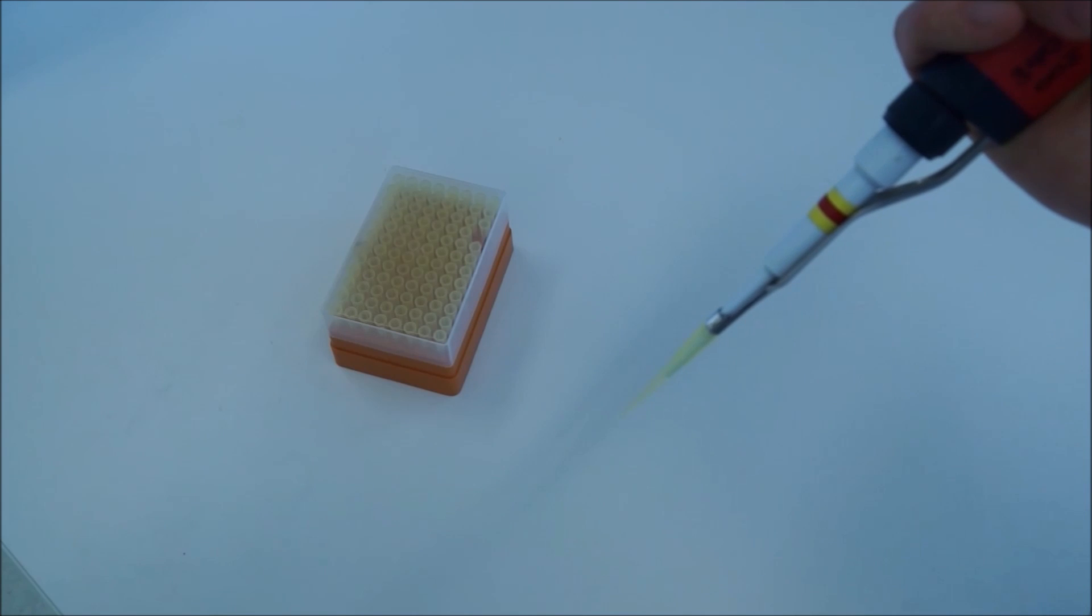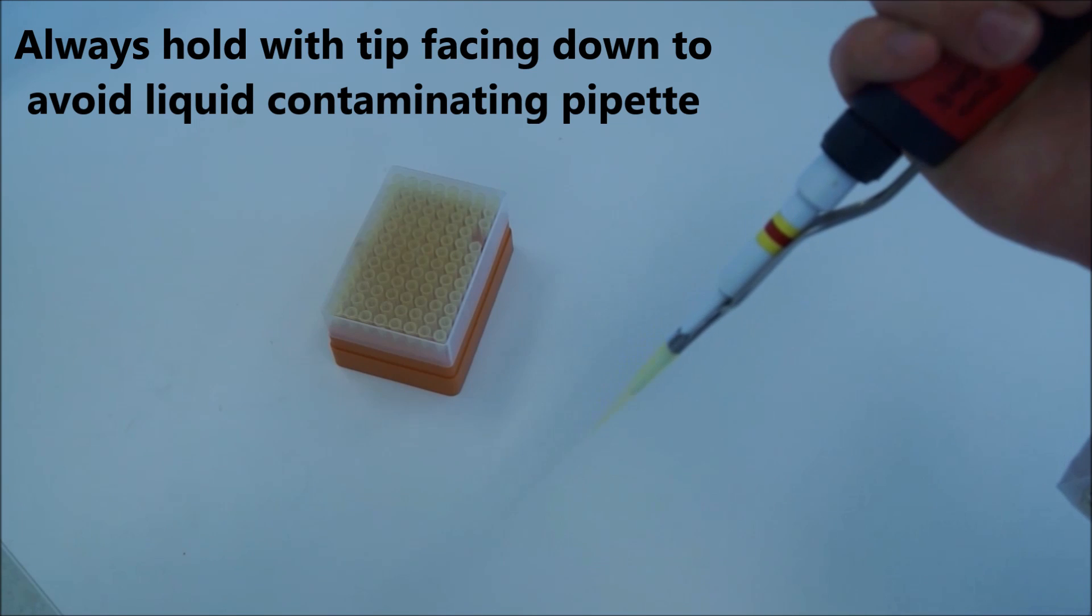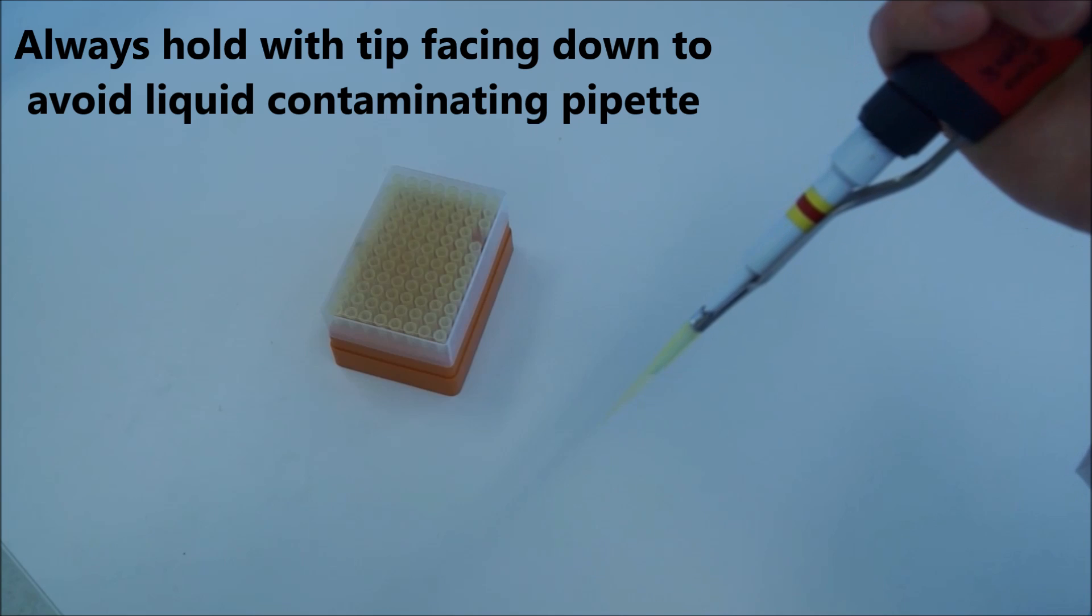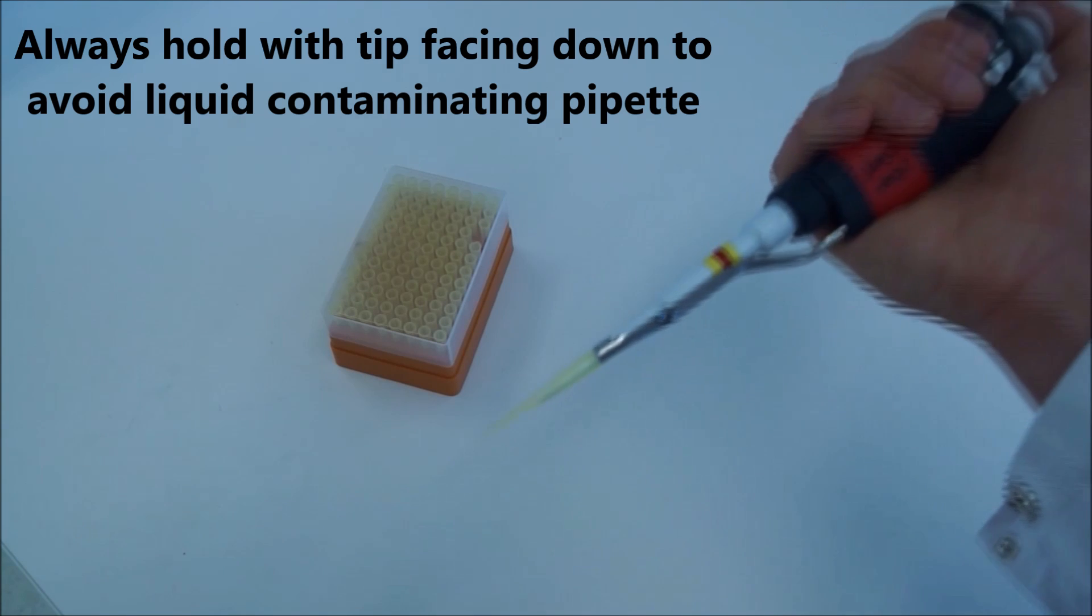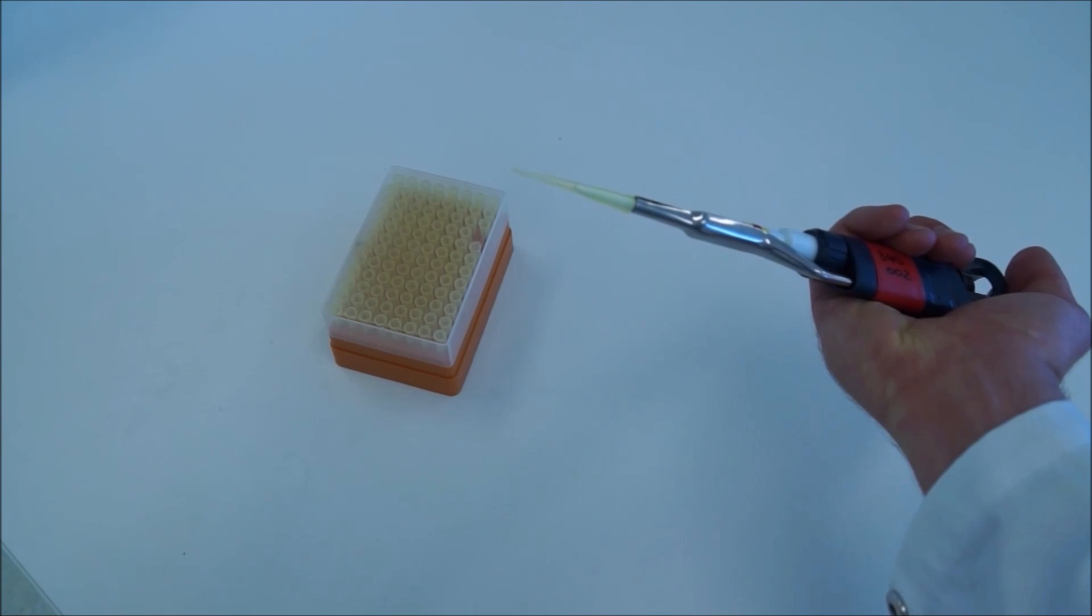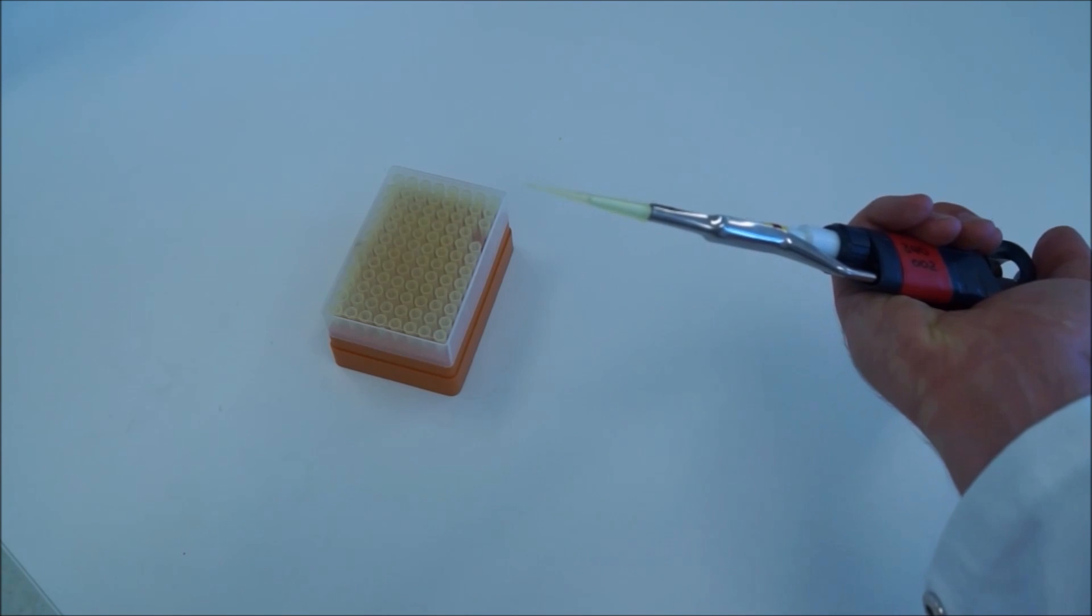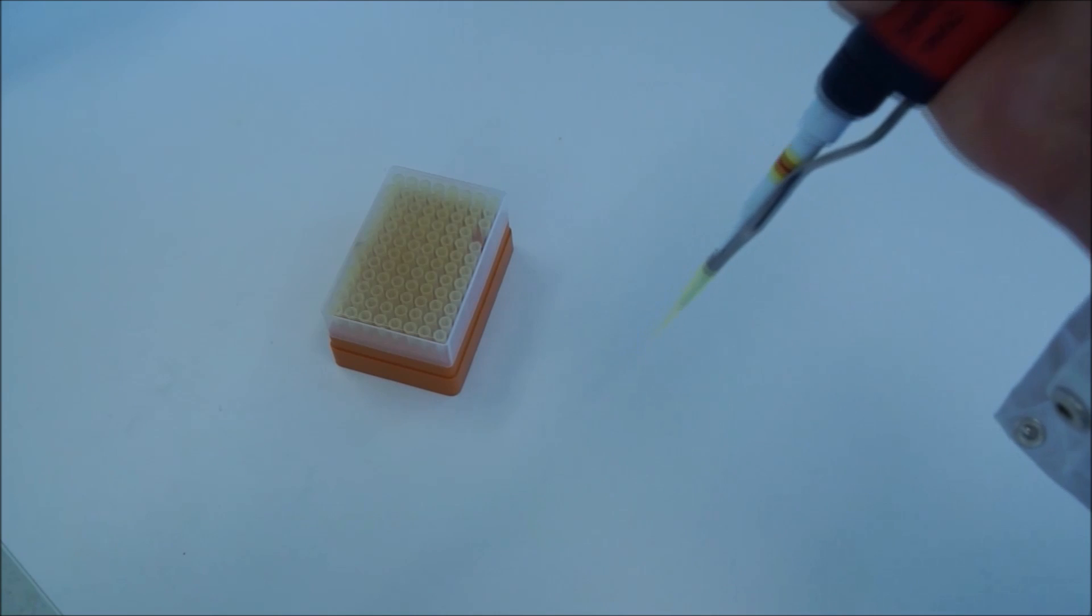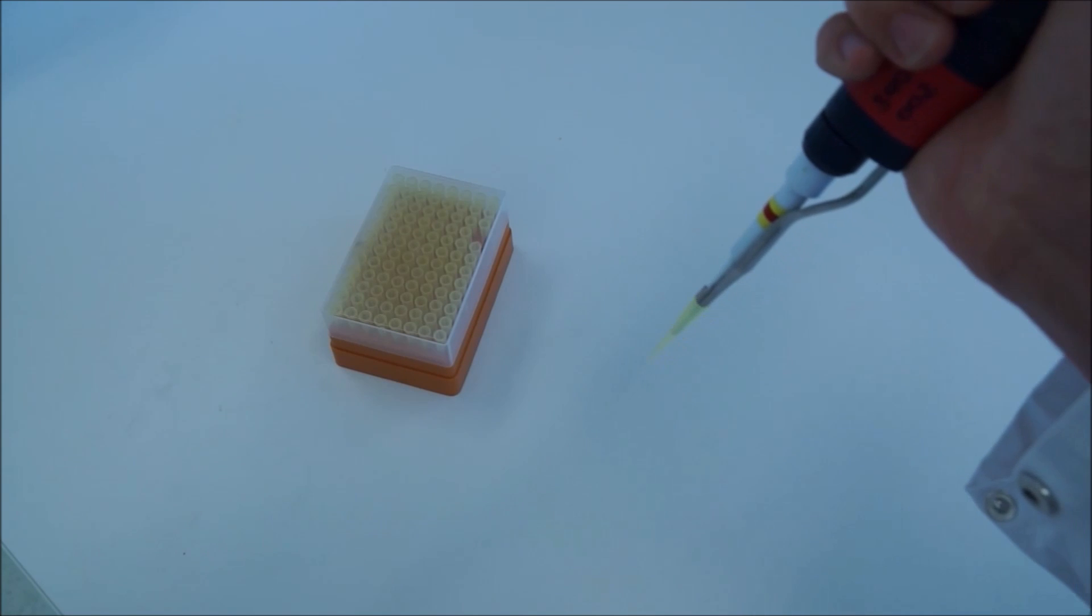When you've got the pipette tip on, try to always keep it facing downwards because if you have liquid in the pipette tip and you turn it up the other way, well, liquids obey the laws of gravity so they'll go down into the actual pipette and contaminate it. So always try and keep the pipette facing downwards.